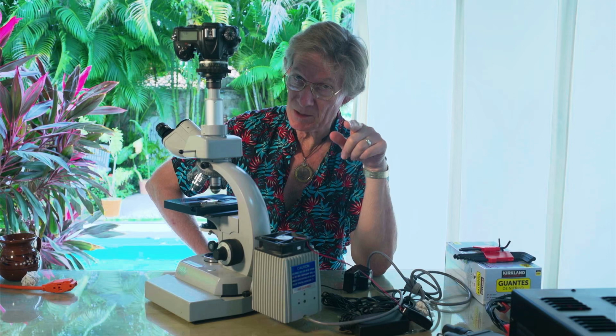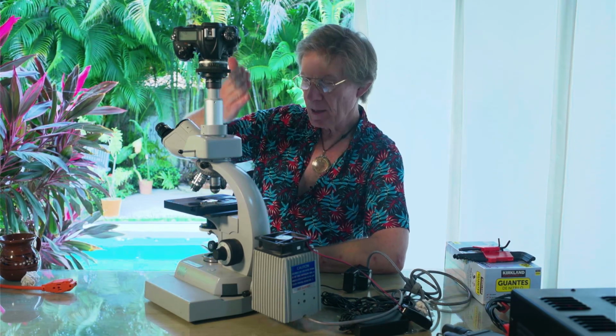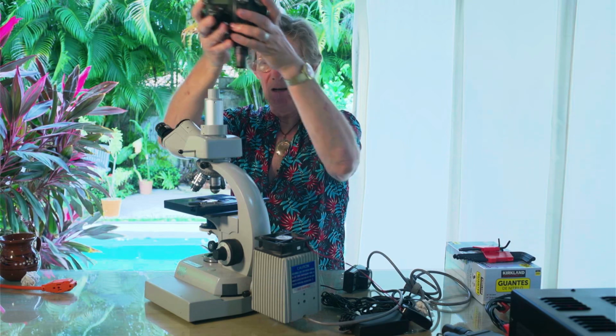There's that word again, resolution. Okay, not revolution, resolution. And when we get there, we will have pictures that are startling and beyond world class, as a lot of microscopists do these days with very sophisticated and incredibly expensive microscope systems that they have acquired for clinical work. So the camera is important. How it works, how it functions, how it's integrated into the system is also extremely important. So we've covered pretty much all the different aspects.